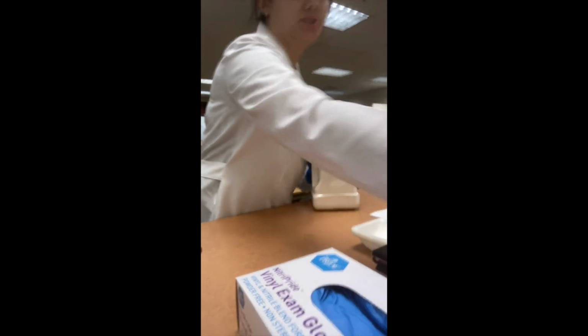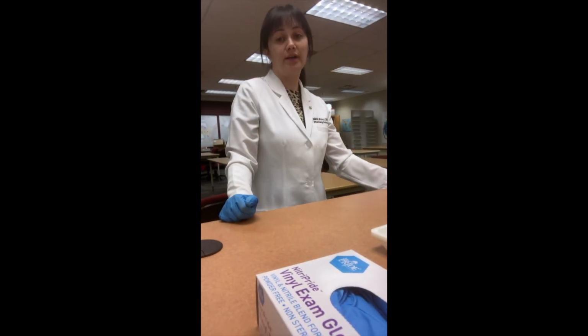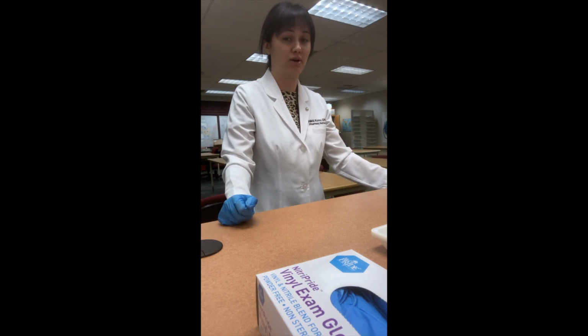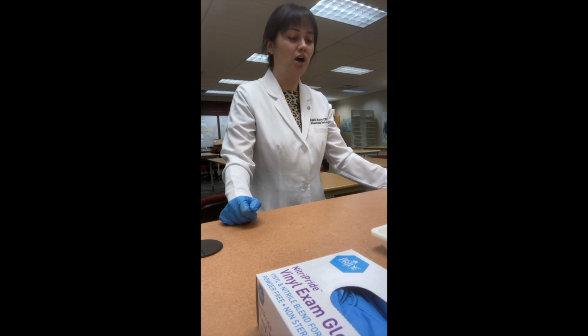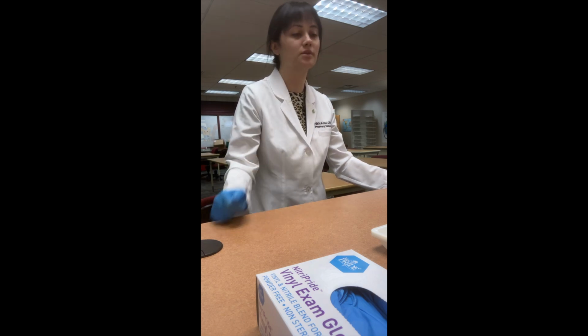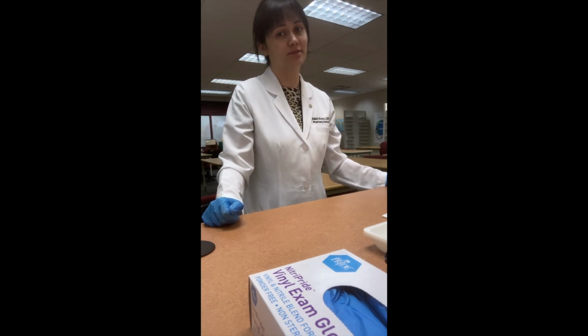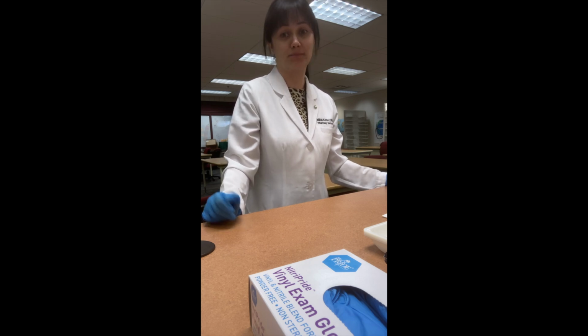This is really important to do when you're actually compounding medications, because one of the things you need to verify is an expiration date, and if you're making a compounding product, you always want to make sure that the patient is aware of when the ingredients you're using expire. Normally, though, whatever you're compounding will expire before the expiration date on the products you're using. Another reason it's important to verify this information is that it helps you double check that you chose the right product to compound.